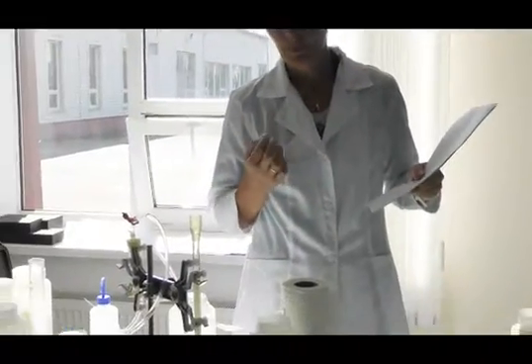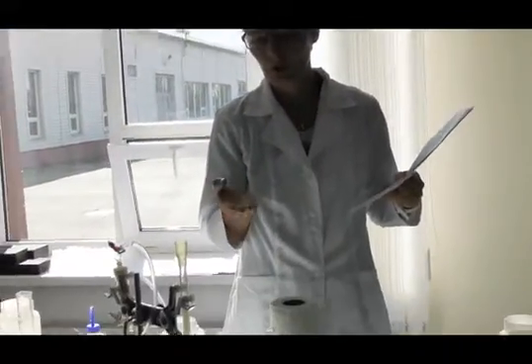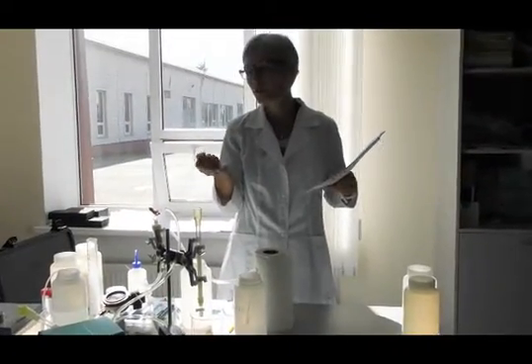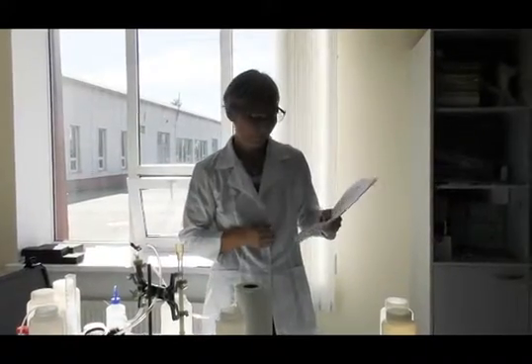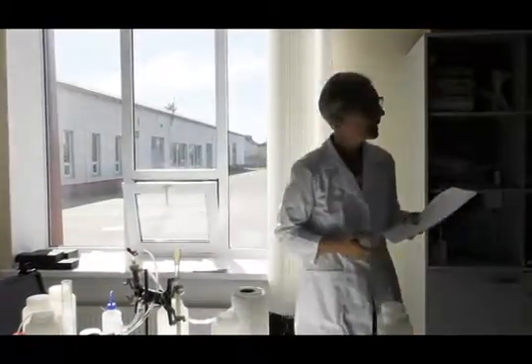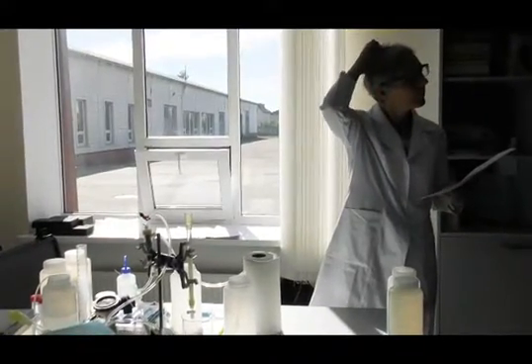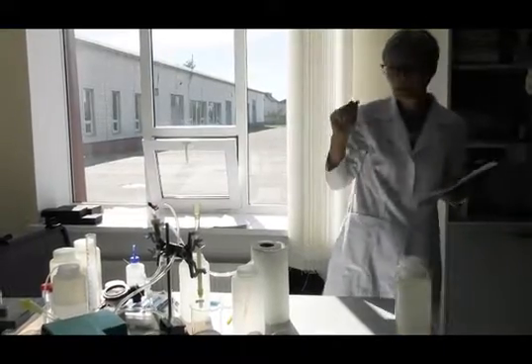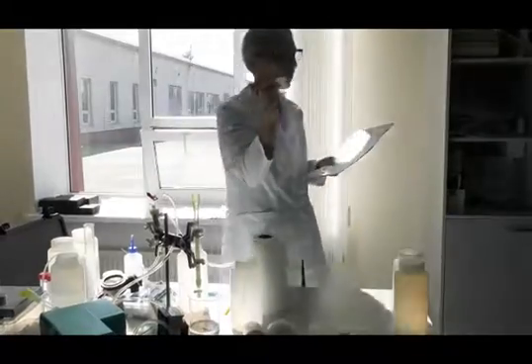So it could be that if there are a lot of plant parts and so on in the total water, we would like to filtrate with this 100 micrometer filter even before we do the total sampling. Okay, but in the end you put them together to measure, because it is 2 parts of one sample, no? The filter this and smaller filter. No, yes, this is just a pre-filter.